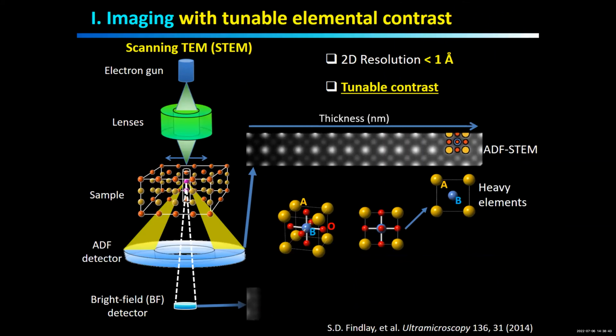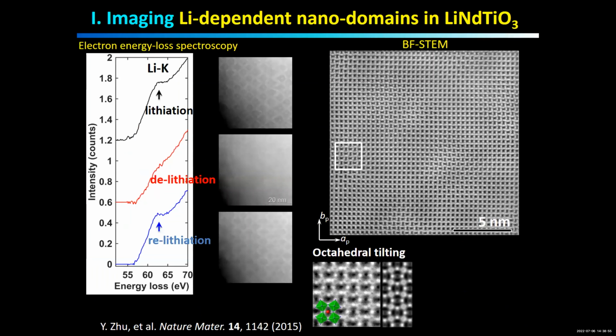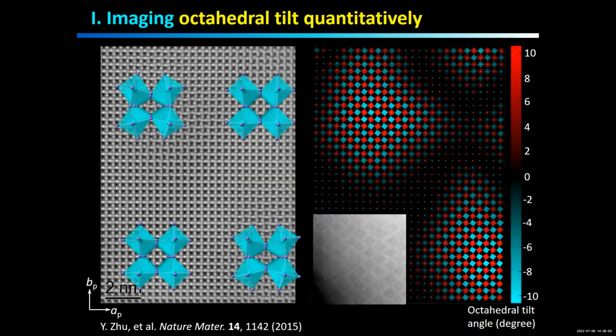So if you want to distinguish it from the electron scattering, that will be difficult for the carbon, nitrogen, and the oxygen because they are next to each other. Yep. So that's sort of the smallest difference, right? But we can always try to distinguish them using the spectroscopy, such as the EELS.